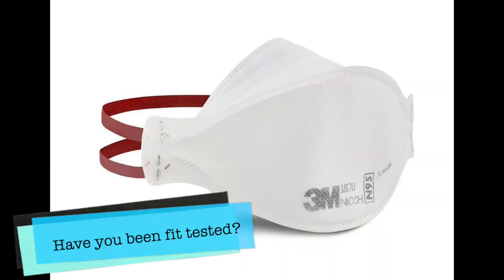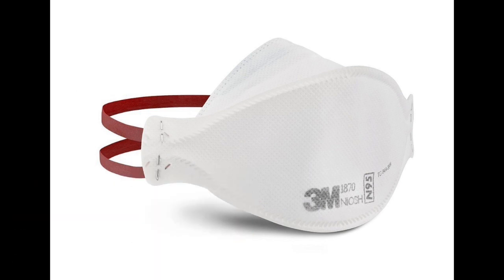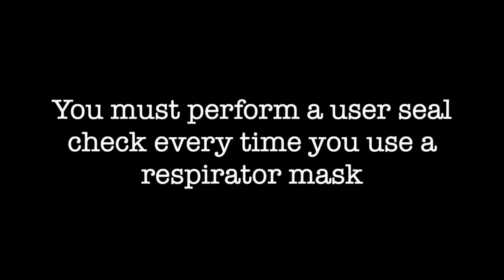If your hospital uses one-size-fits-all N95 masks like the one shown here, you may proceed. If not, you will need to be mask fitted before proceeding. Keep in mind that a mask fit test is not the same as a user seal check. Fit tests are performed occasionally and assure the right respirator choice for the person, the size, the characteristics of the respirator. A user seal check is performed every time and assures the respirator is working before you enter the room. You must perform a user seal check every time you use a respirator mask.